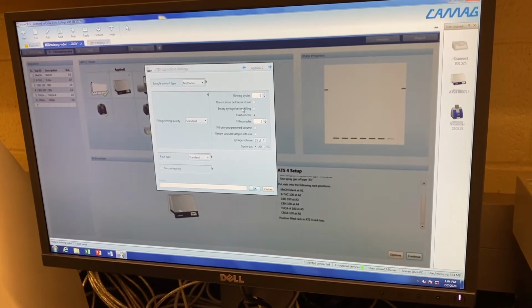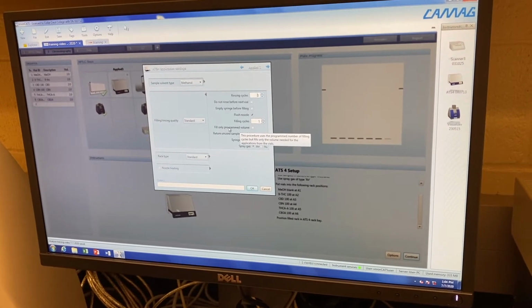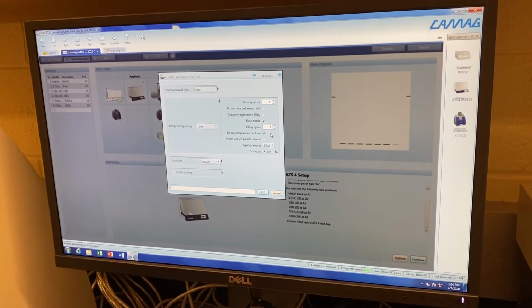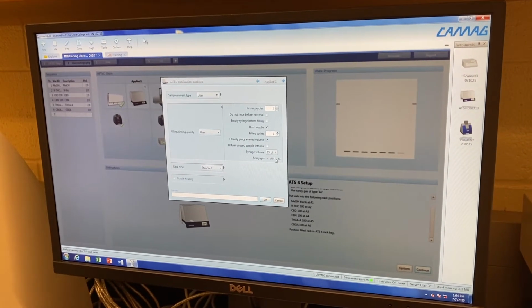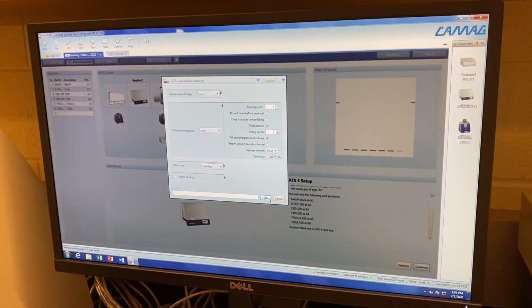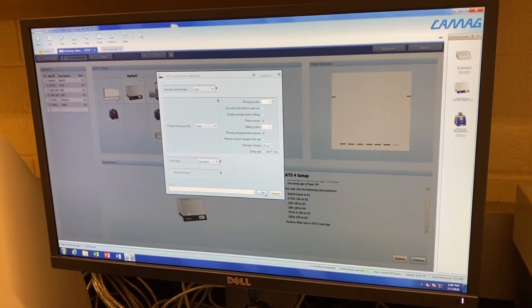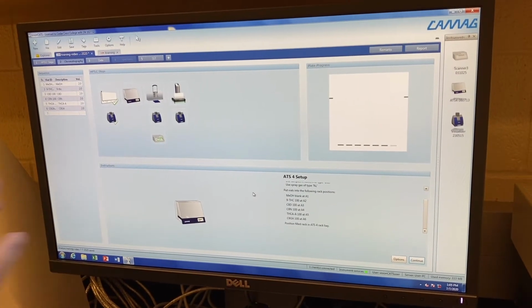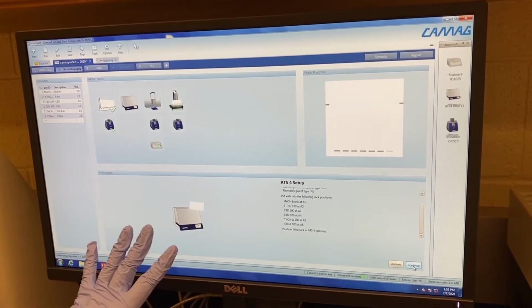And then you can choose which one you want to apply. I would choose fill only programmed volume, so this will save you a lot of the sample or the standards if you are using it for research. And then our spray gas is N2, so change that to N2. And then click OK. But this is only for my research, it's based on your own method. So for now, that was set. Everything is ready, so we can click continue to let it apply.